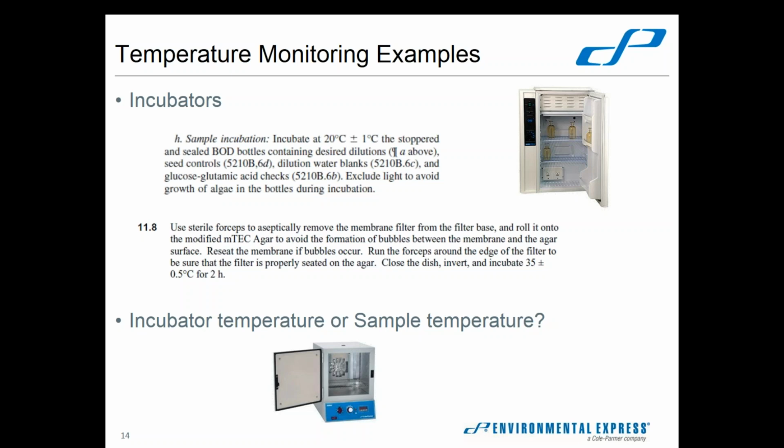You've got your heating elements around the air, and so you are actually heating the air inside that container to a certain temperature, and then you place your sample in there, whether it be your BOD bottle or your, why am I blanking on the dish?